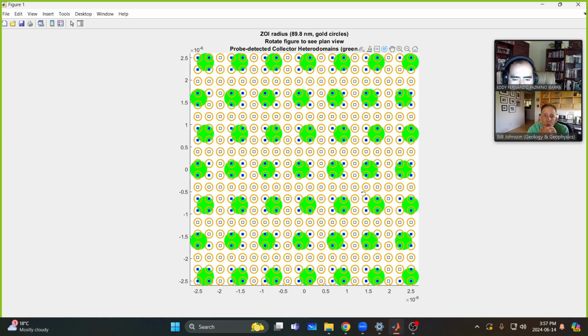Okay. So you can see this nicely in plan view, and that's what we encourage you to do. When you generate this three-dimensional plot, don't just look at the default angle, rotate it and get a sense of the relationship between AFRACT and this overlap. And you want to talk about the profiles? Something to add here?